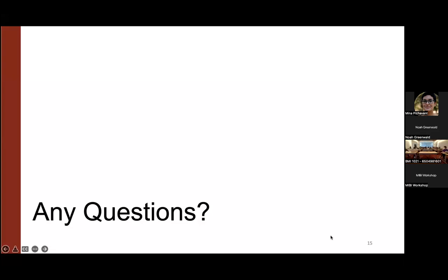How do you search for validated antibodies in the literature or from companies? What's a good method? Our lab will discuss this heavily in the next few talks. We like to use platforms like BenchSci or CiteAb to cast a wider net, but we also have some trusted companies that we always go to first, and those will be discussed further.